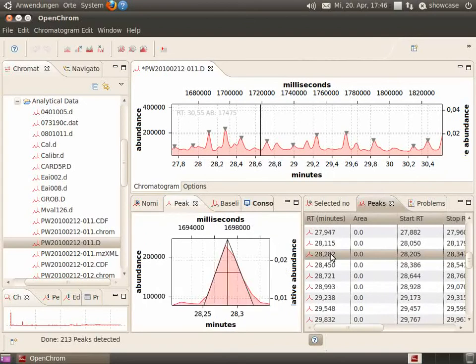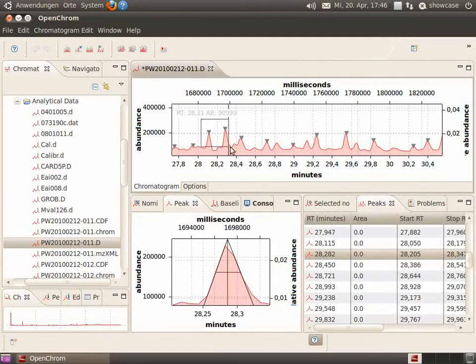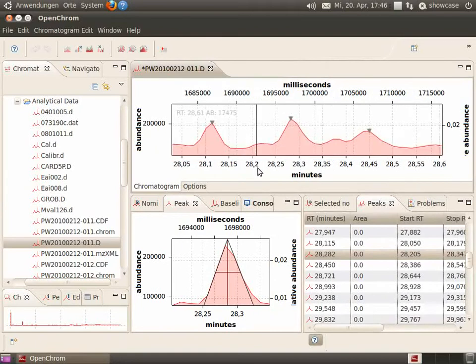Let's select the peak at 28.28 minutes. You can see it here.